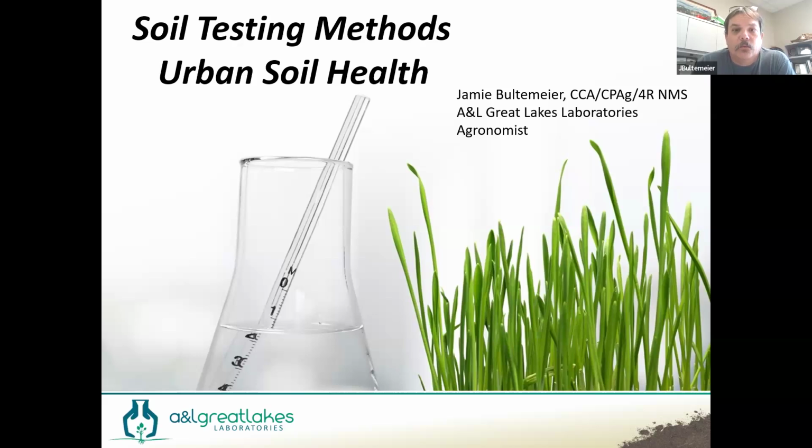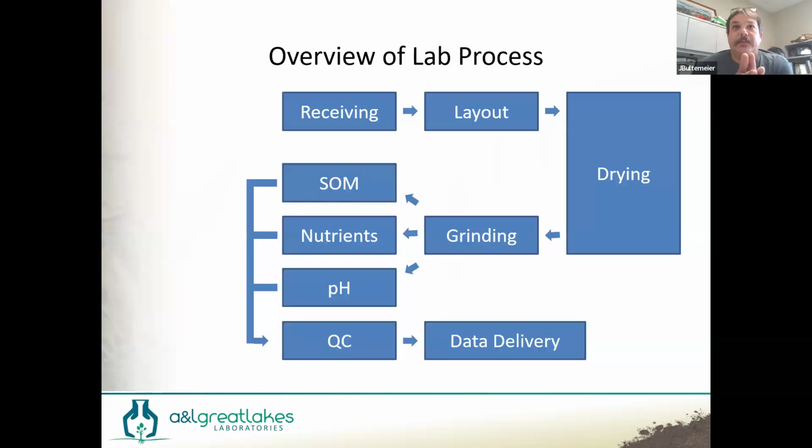When a sample comes into the laboratory, it comes in through receiving. That can be through the front door at the laboratory. Somebody can come and say hi to Kelsey and drop it off at the front desk. Larger shipments go to the loading dock in the back. But regardless, it goes to the receiving department, and that gets processed and sorted. Is it a soil? Is it a plant? Is it manure? It gets routed to the correct location in the laboratory.